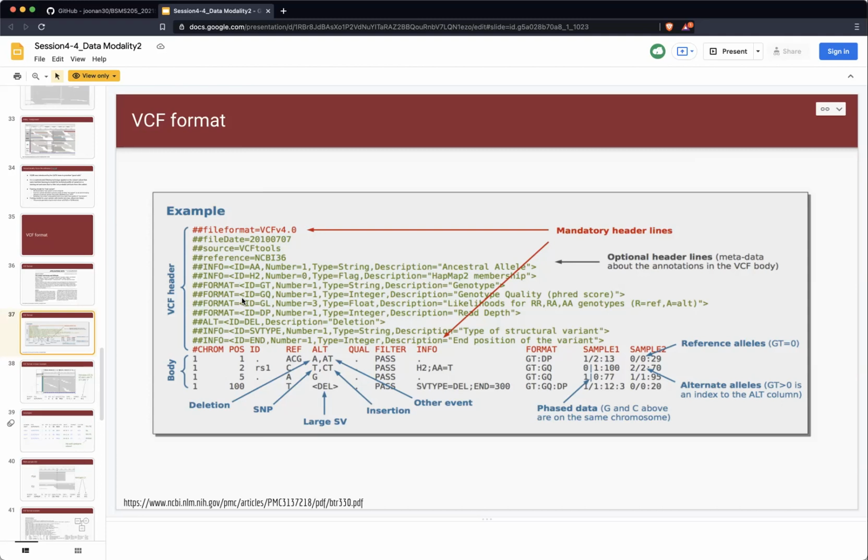What the VCF header contains is a sort of commentary on how they made the VCF in their analysis, which version of the reference genome they used in the data set, and what kinds of information they store and we can find in the VCF file. These comment-style lines are one of the conventions people use in computational science. If you store a certain data set, people always put their notes or tags in the file. Not just the VCF file: if you work in computational science with files for other purposes, people can also leave their comments in the file, and VCF follows basically that notion.